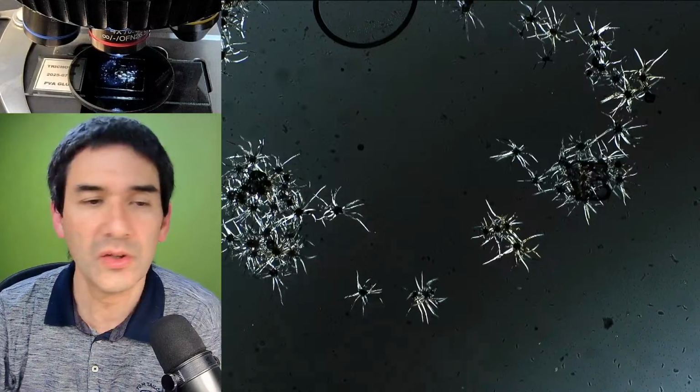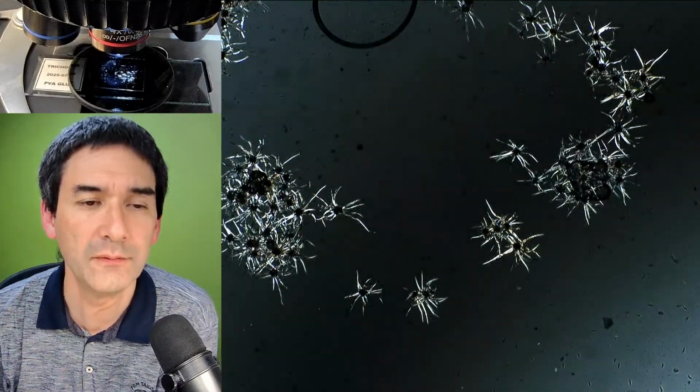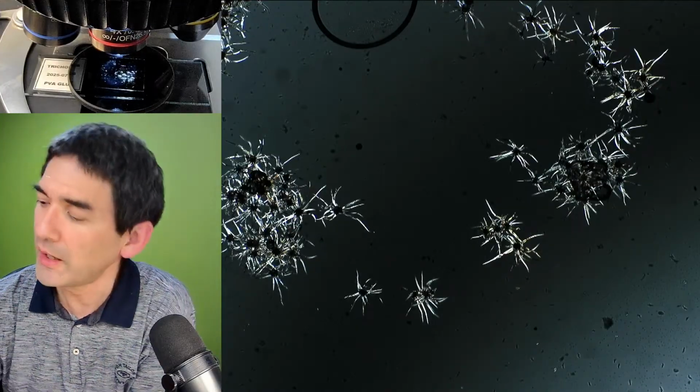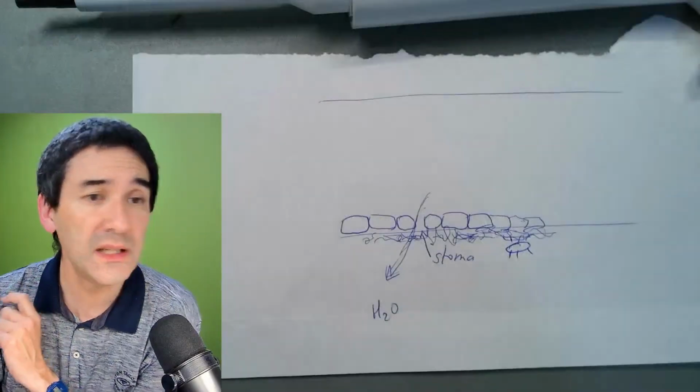So there are also plenty of opportunities. If you want to try this out yourself, cross-polarized polarization, that's quite easy to do, because all you have to do is place, and I'm going to show this to you as well. Let's go to the desk view.